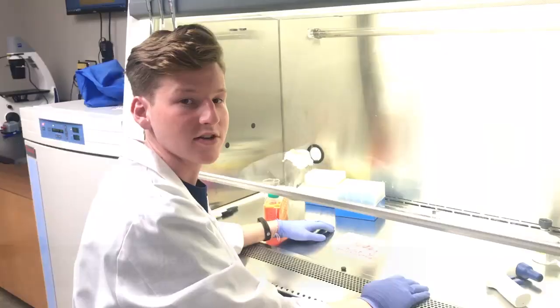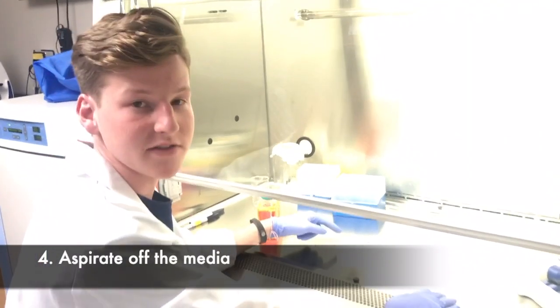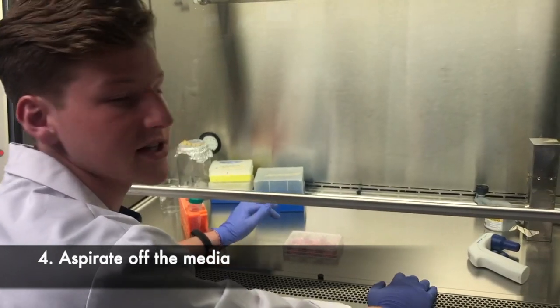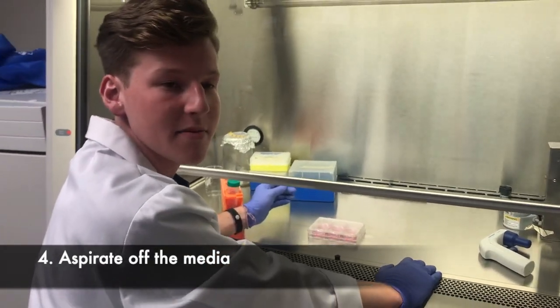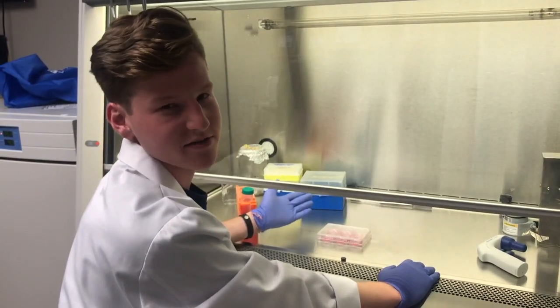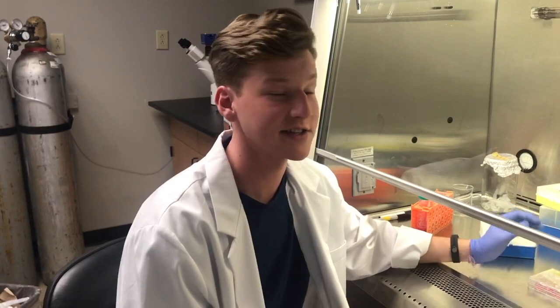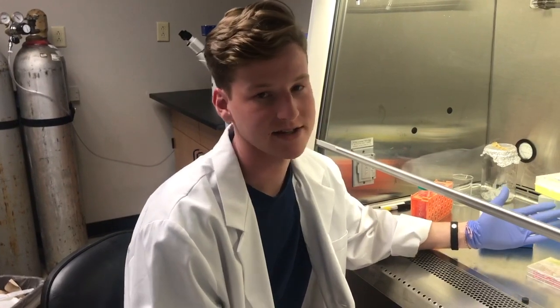Now we're going to aspirate off this media and replace it with fresh low serum media. For these cells I will be using 1% serum, but for your cells use whatever is recommended. When you aspirate, if your cells are adherent, be sure not to touch the bottom of the well because you could suck some cells off. Also use a new tip for every well to minimize contamination.